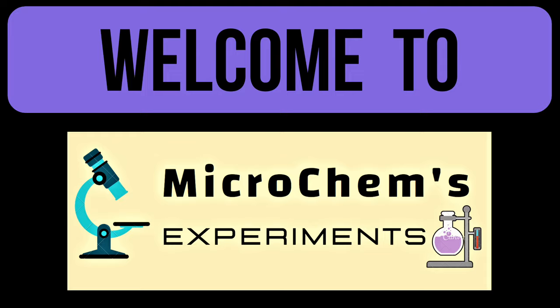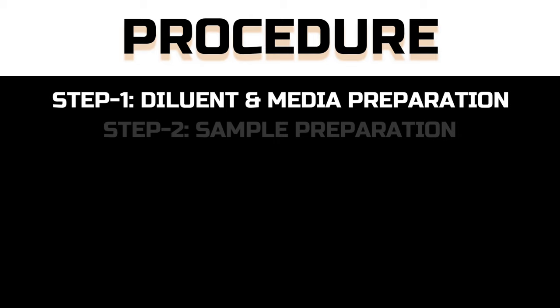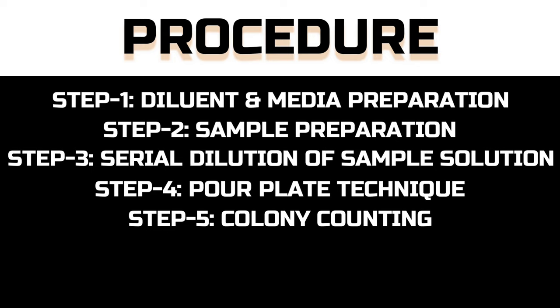This test involves 7 steps: diluent and media preparation, sample preparation, serial dilution of the sample solution, pour plate, colony counting, result interpretation and calculation.